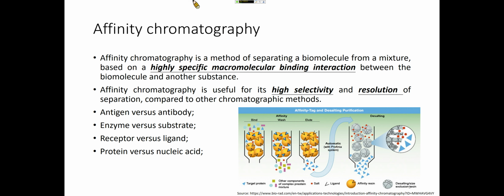Affinity chromatography is a type of liquid chromatography for the separation, purification, or specific analysis of sample components. It utilizes the reversible biological interactions or molecular recognitions called affinities, which refers to the attracting force exerted in different degrees between atoms which cause them to stay together. The examples of affinity interactions are antigen versus antibodies, enzyme versus substrate, receptor versus a ligand, and protein versus a nucleic acid.